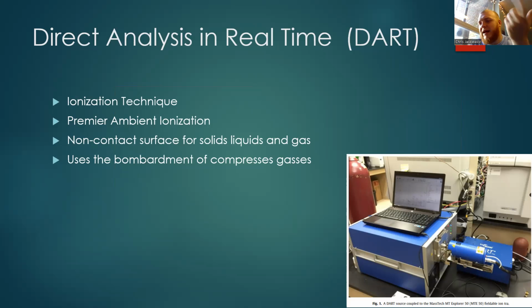It's not as applied into portable mass spec, largely because one of its main agents is using an inert gas accelerated through the substance into the machine, which really takes that ionization along. So that kind of application of the bombardment of compressed gas has really reduced its applicability to portable.